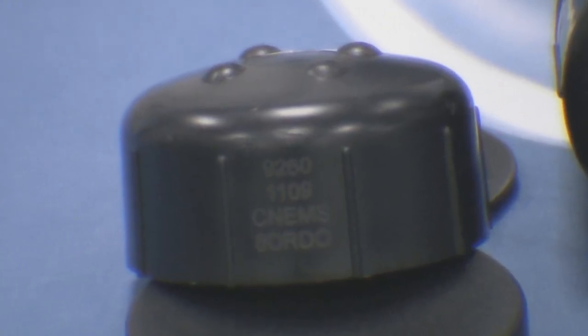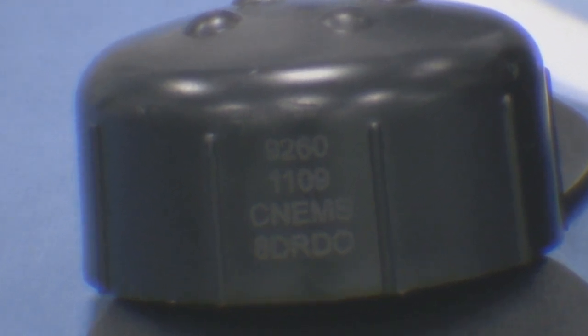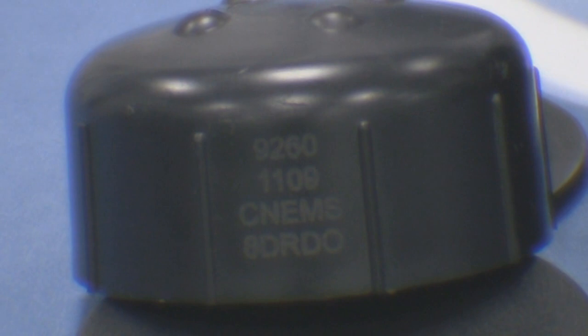On your new sensor cap, you will find a sensor code. You will need to enter this code into your SC controller. This enables the factory calibration of your cap to be uploaded into the controller and your LDO probe to operate correctly.